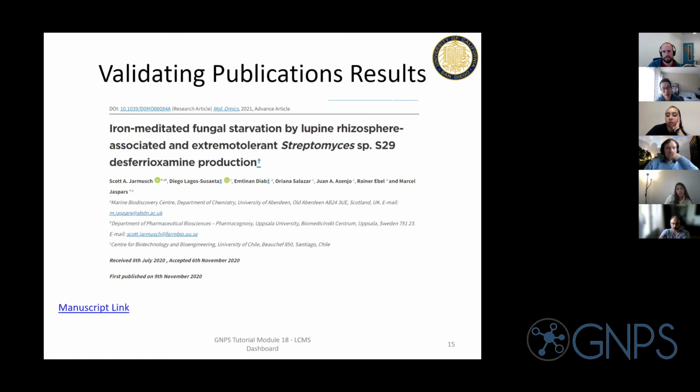If you're on the proteomics side, most of the ProteomeXchange repositories are supported, and also GNPS and MassIVE, so public data sets and private analysis files that you ran GNPS jobs on, as well as you can upload your own. But generally, when we make this analysis and visualization, we pull all the files locally. We have a reasonably fast internet connection, but it's not infinitely fast. So our general cutoff is about 100 files for visualization. Beyond that, a lot of our visualization throws so much stuff into your browser that browsers generally start crashing. So that's one of the things that we're contending with.